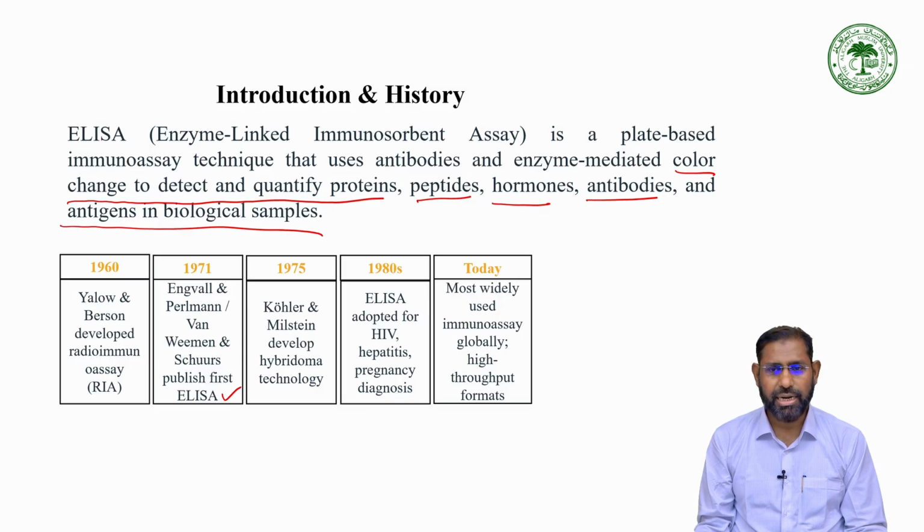Today it is widely used for immunoassays globally in a high throughput format. High throughput format means you can quantify or detect protein in a large number of samples.